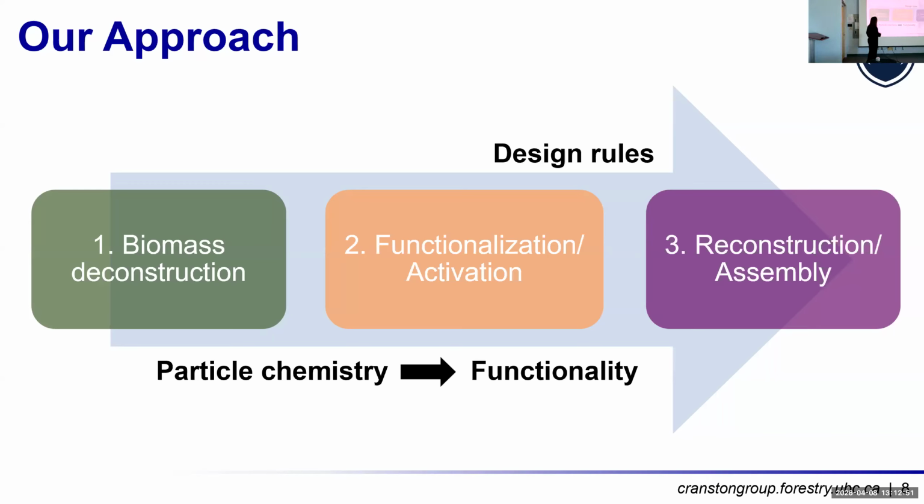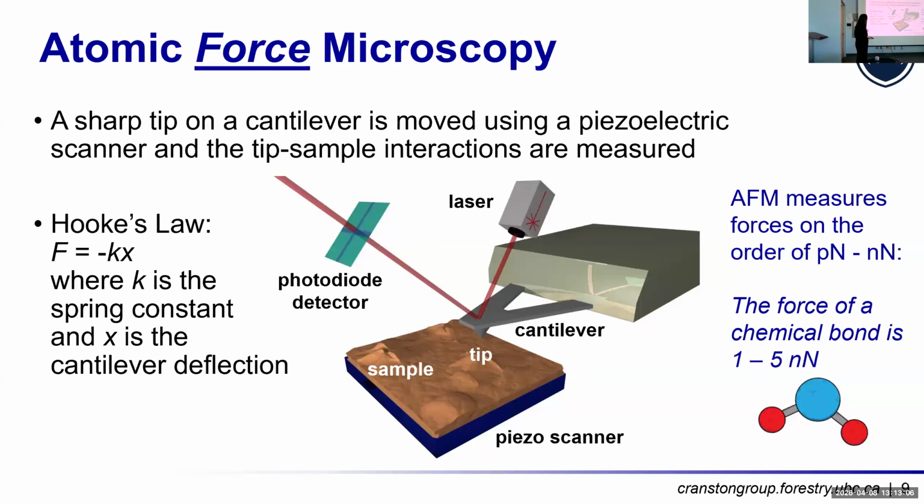And from my experience and background, what I'm really trying to do is link particle chemistry to functionality, and AFM turns out to be a really helpful tool to make those connections. So that's sort of where most of the projects fit in that I'm going to talk about today.